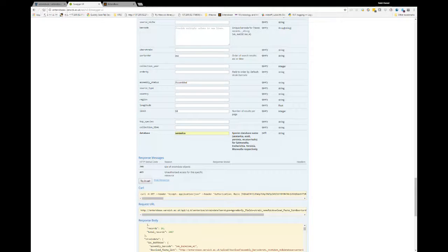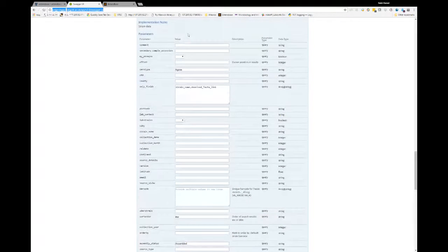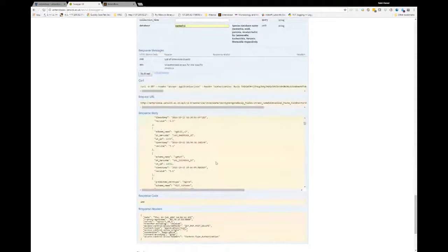Okay. When you're playing with it, it should give you an error if the value is incorrect. If you're trying to put nonsense in there, you'll just get back nothing, as if you've just done a bad web search into any of these fields. This particular one, only fields, relates back to the parameters themselves, and the ones you see in the output in the response body section.